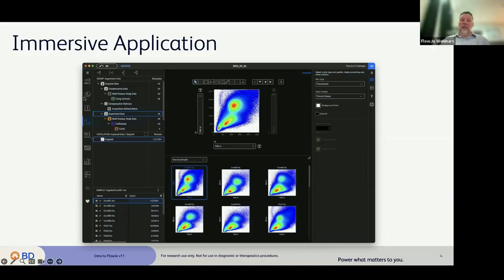The QC algorithm is here under the QC platform. These double overlaid histogram looking, kind of the M, that's your matrices or unmixing compensation tools. Then we have our graph window area. Then we have the algorithms, that's tSNE and UMAP. Tables, charts, that's your pie charts and your bar charts, and then reports. And down here at the very bottom is your heart icon for modifying preferences.